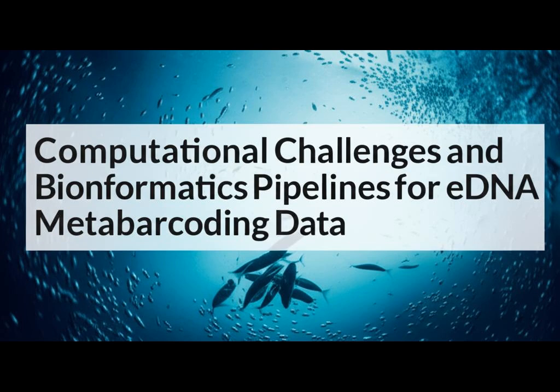Sounds straightforward, maybe? Well, analyzing eDNA data comes with significant computational hurdles. The sheer volume of data generated by sequencing is immense, often hundreds of gigabytes per run. Storing and processing this requires serious computing power, often high-performance clusters or cloud resources. There isn't one single perfect pipeline.